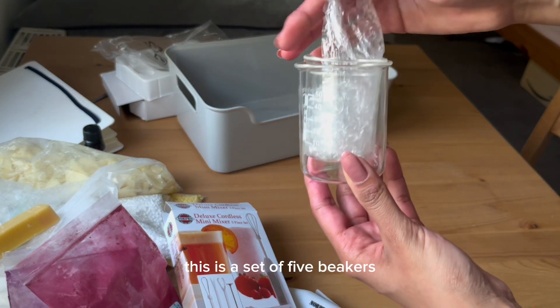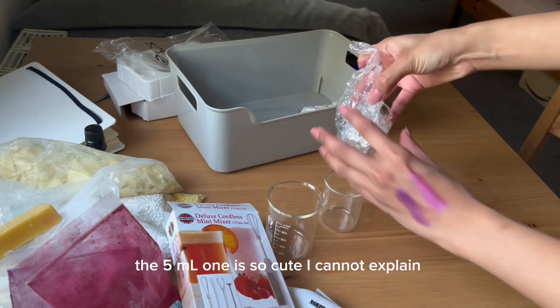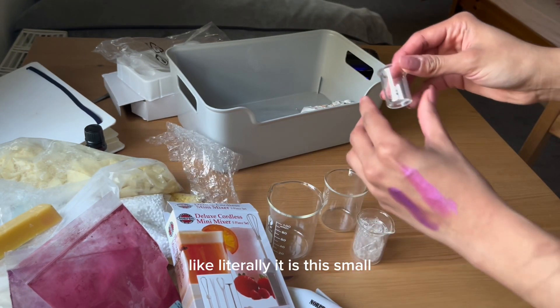Then I got beakers — this is a set of five beakers, ranging from 100 ml down to 5 ml. The 5 ml one is so cute — I cannot explain — it is literally this small!